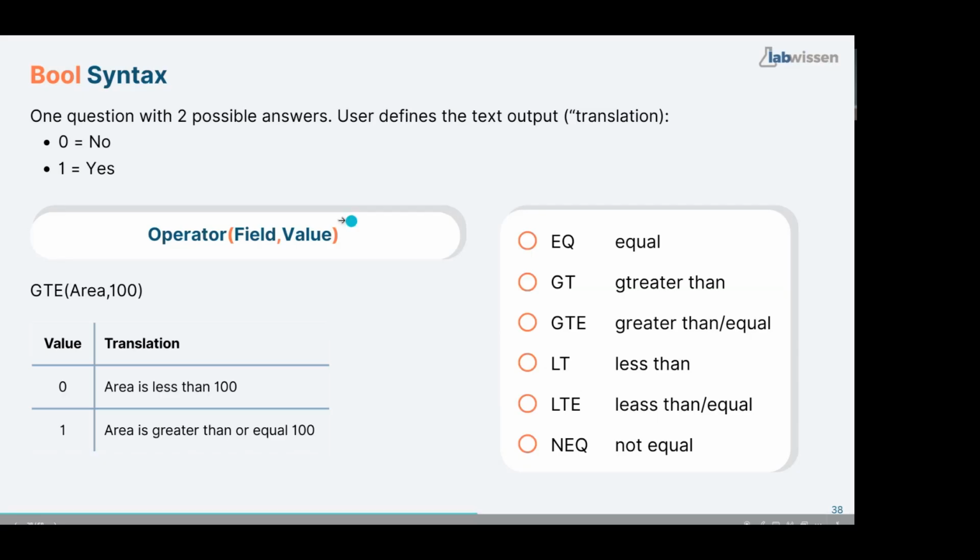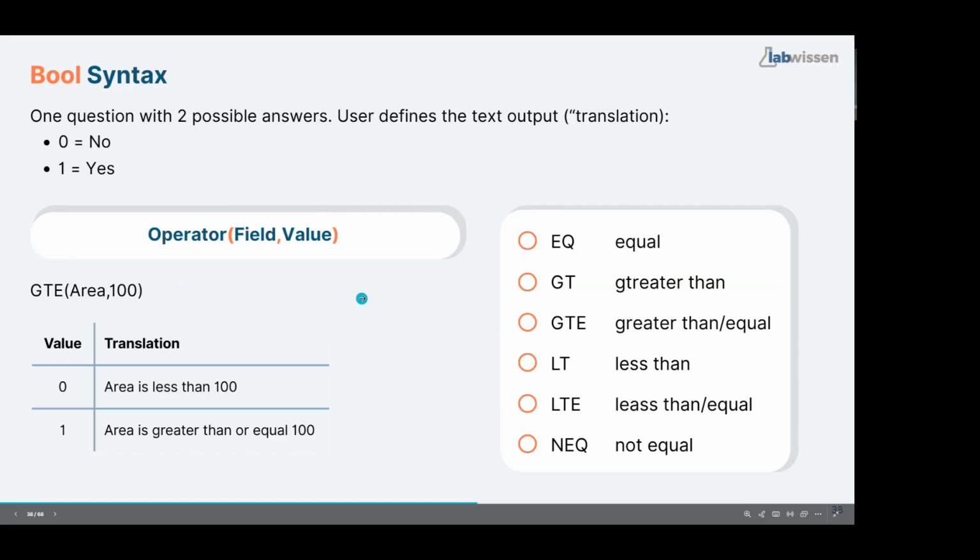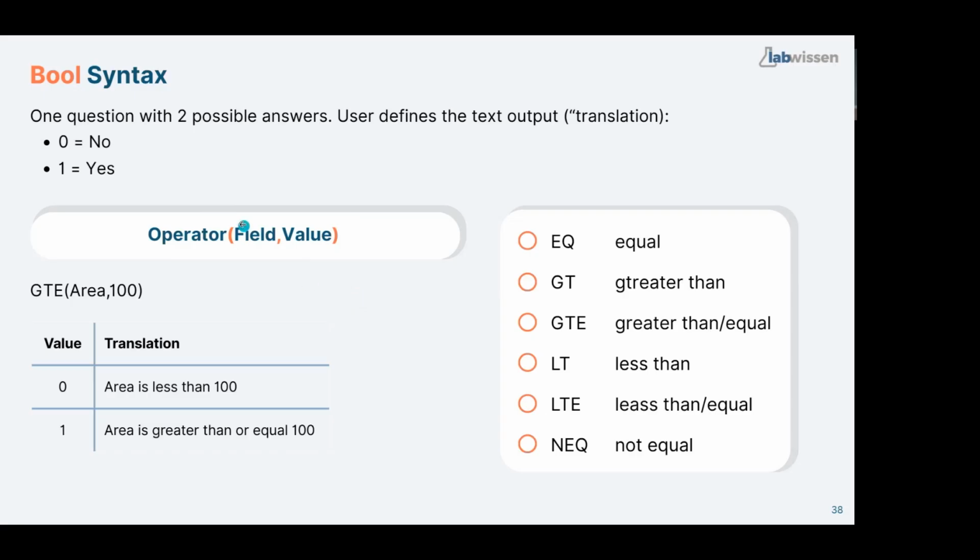I hope you can remember this syntax. Please do it. Very important here, you put brackets, you put comma between field and value, and you don't put any spaces. No spaces, please. Yeah, remember, no spaces in formulas.